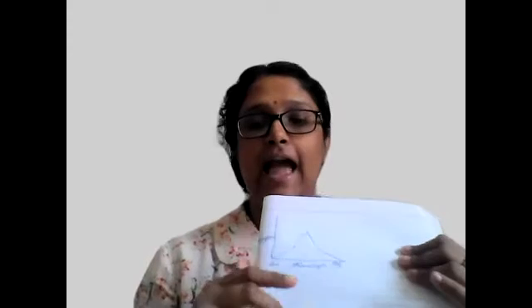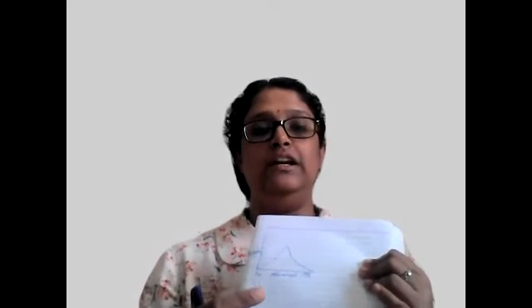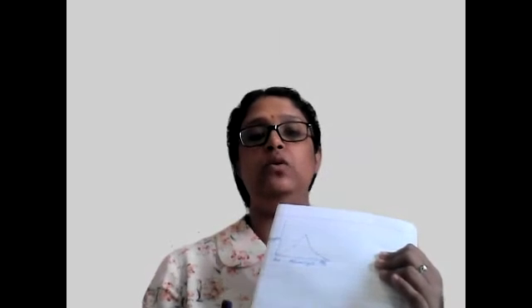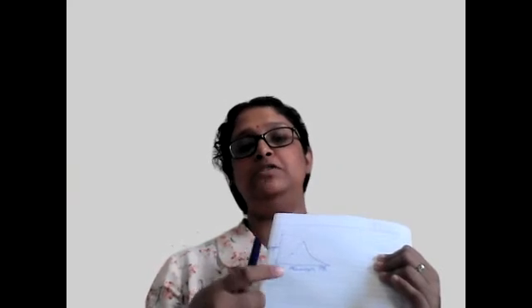Why is a compound giving out a certain color? Say, the ink I have used here is blue in color. Why? Because it absorbs everything other than blue and it reflects blue. So the absorption for blue color for this compound is minimum, and that's why something with a blue color will have an absorption maxima in the opposite spectrum, somewhere in the yellow, orange, red spectrum.